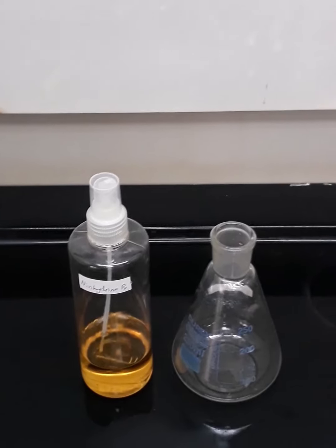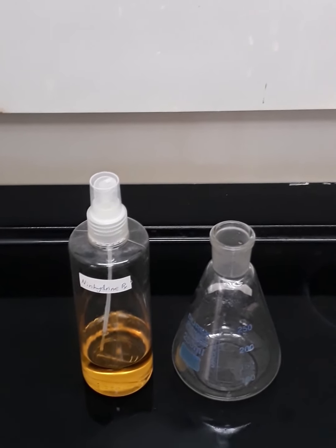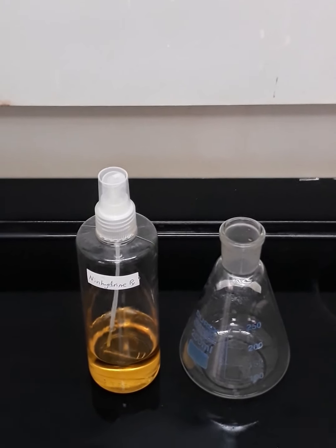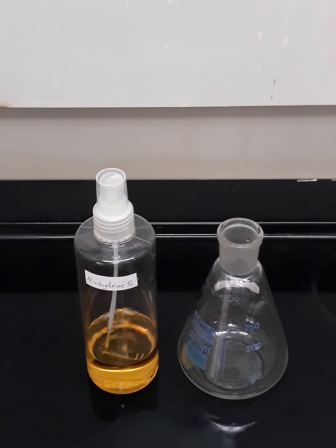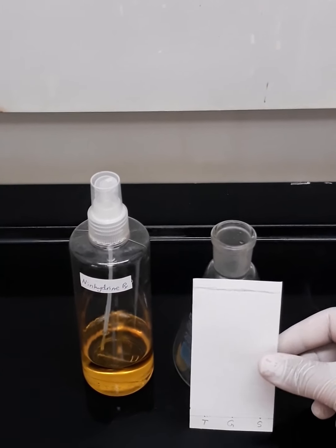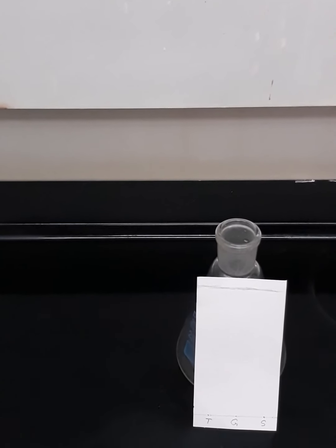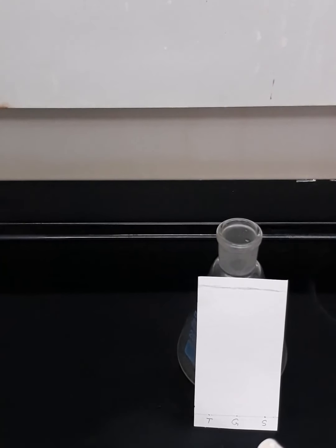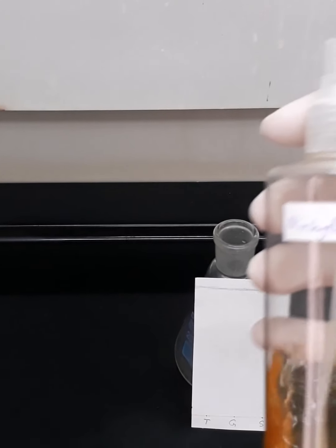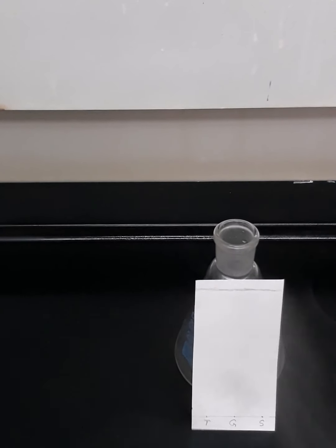So now we are going to proceed with the next step, which is spraying the chromatographic paper, after being dried, with the ninhydrin solution. So this is the chromatographic paper. I will place it here just as a support. Then I'm going to spray. Please make sure that the suction is working, so whatever gas is coming from the ninhydrin sprayer, you will not inhale it. Now I'm going to spray it, as you can see.